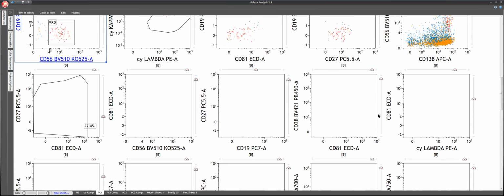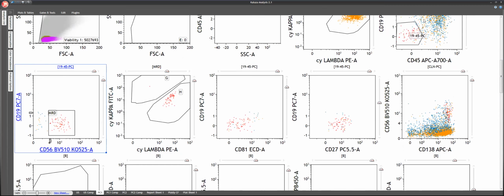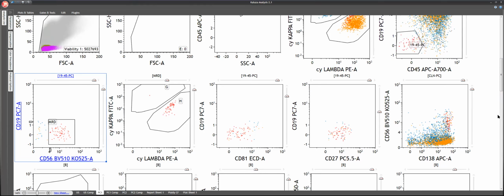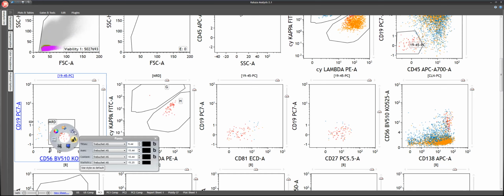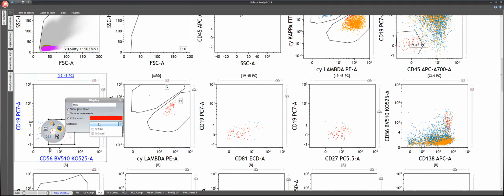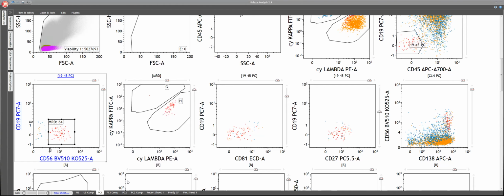I have some empty plots just to look at different aspects and different combinations of these cells. But here we got easily CD56 positive, CD19 negative plasma cells. There was no need to use these plots for the other combinations. Okay. So if you look at this, how many cells are there? Take a number, and there are 64. So we have evaluated 64 cells in 5.4 million cells.